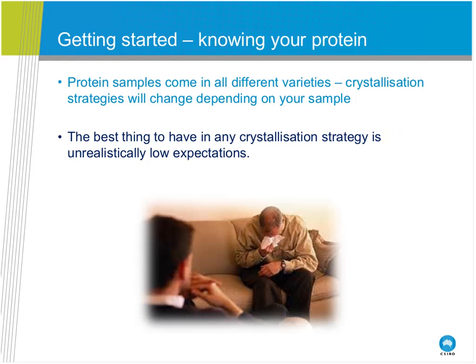When we get started, we have to appreciate, and I'm sure you all do, that all proteins are different, they behave differently, and the thing to really remember is that your crystallization strategies will change depending on the protein that you have. One thing, though, is completely invariant in all crystallization strategies. If you go in with an expectation that nothing will work, you won't be disappointed.